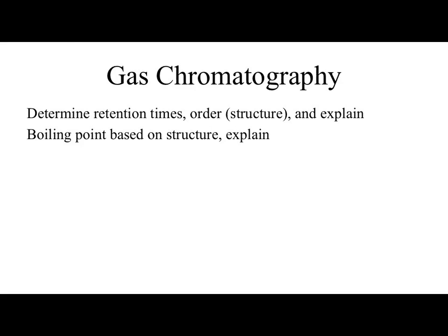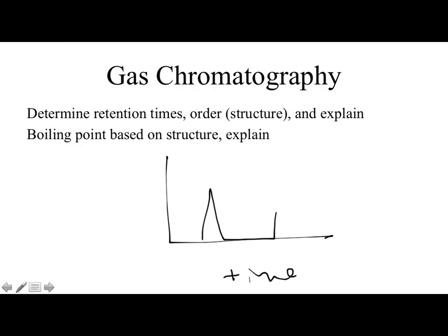I could ask you to determine retention times. That's kind of straightforward and boring as far as you guys are concerned, because when you analyzed it, how did you figure out the retention time? So you had your graph. What's the retention time? I know that's sloppy, but deal with it. Retention time is when our compound came out.